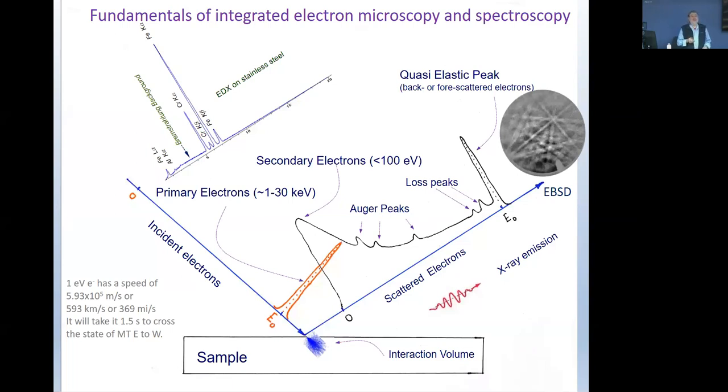What's the absolute resolution we get on these things, Nate? So we are talking about submicron to nano scale type of resolutions. We have here particles, a couple micron size, appropriate for electron backscatter analysis. I think we can get some information on that. I think somebody from your group is asking for that.